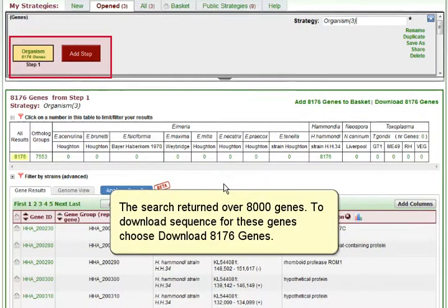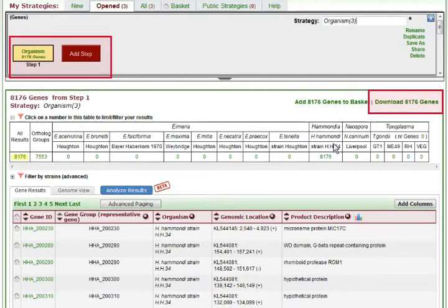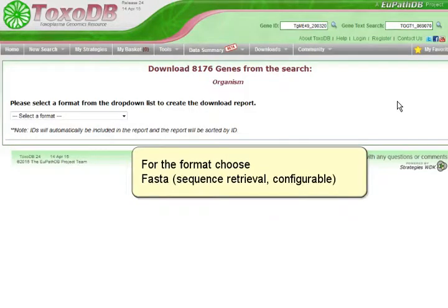The search returned over 8000 genes. To download sequence for these genes, choose Download 8176 genes. For the format, choose FASTA, Sequence Retrieval, Configurable.